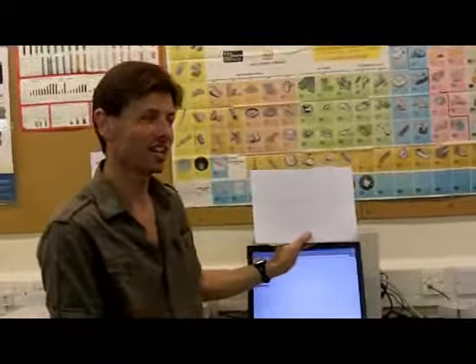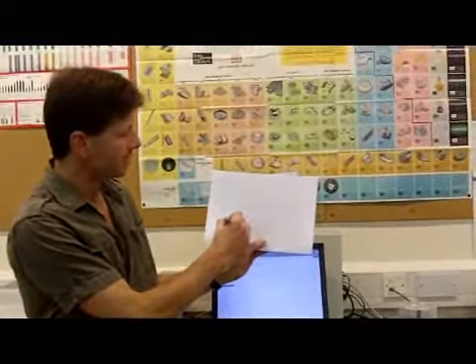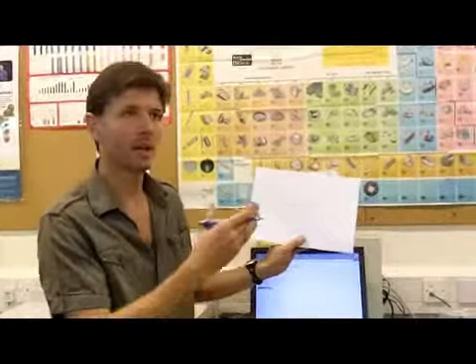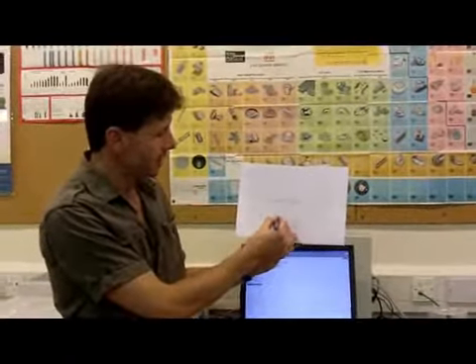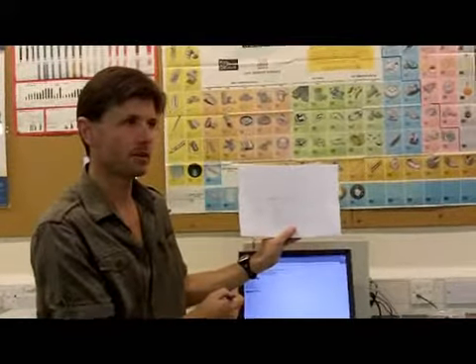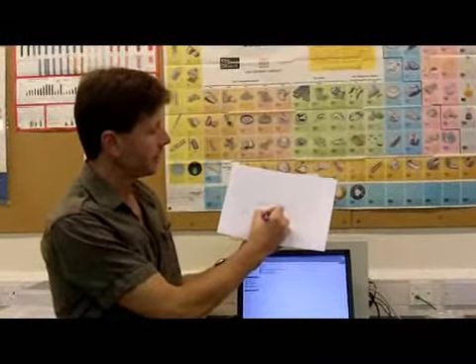Okay, the iodine region looks like that. There are two peaks, and the reason for that is that you're looking at the iodine 3D. And the thing about the 3D is that it's got orbital angular momentum, and the electron spin can interact with that. And it will either be aligned parallel or anti-parallel, and that gives you the two peaks. When you measure the concentration of the iodine, you're only interested in the height of that first peak. It's called the 3D 5/2, that peak.